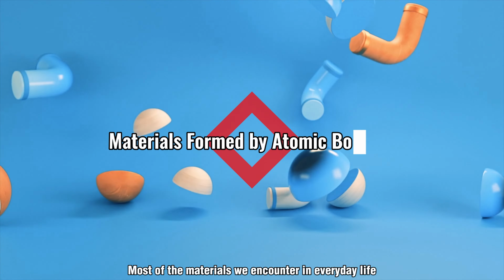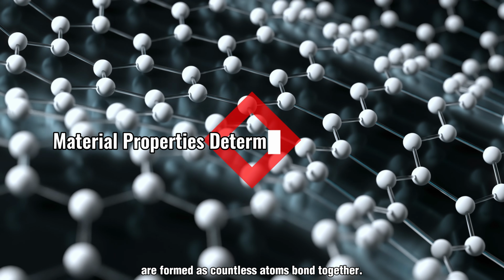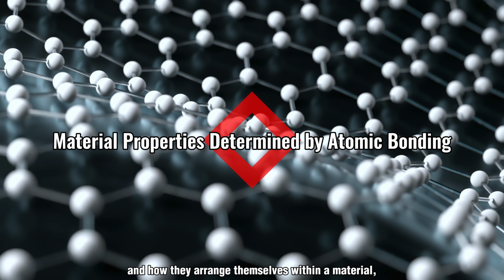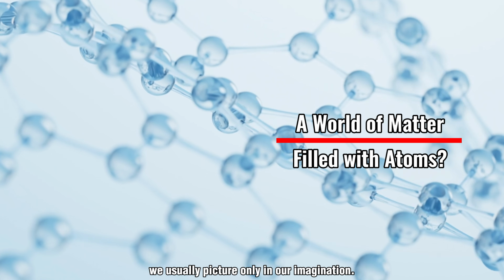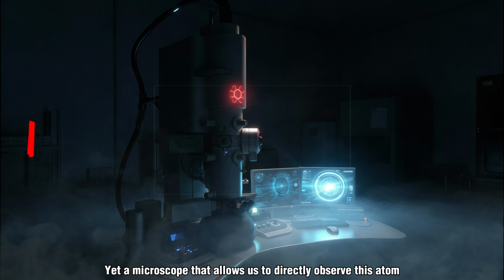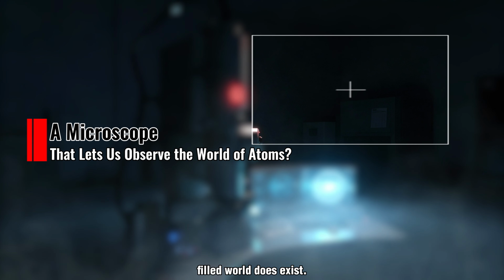Most of the materials we encounter in everyday life are formed as countless atoms bond together. We're always curious about how those atoms bond and how they arrange themselves within a material, but in reality, this is something we usually picture only in our imagination. That's because this world is simply too small for us to see. Yet a microscope that allows us to directly observe this atom-filled world does exist.